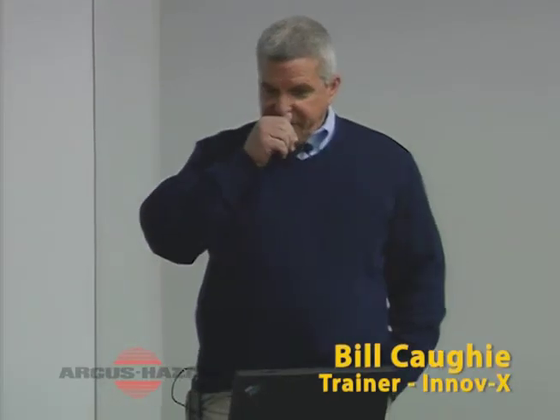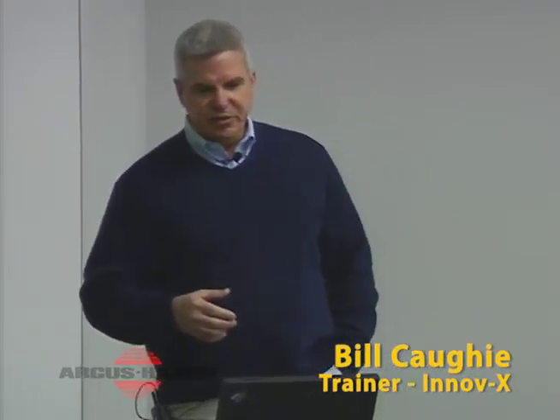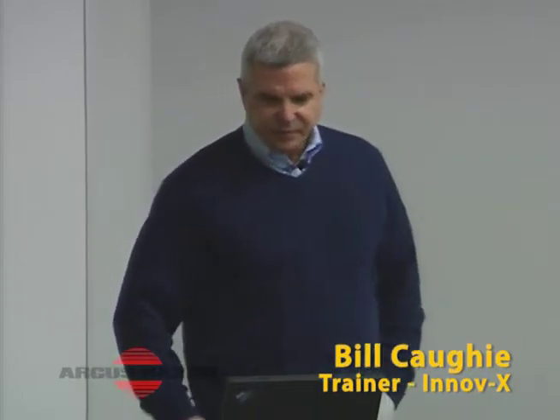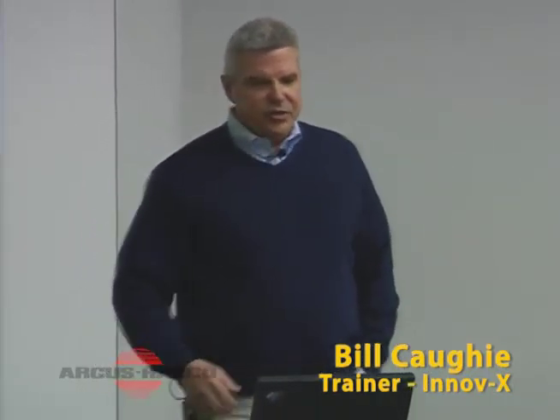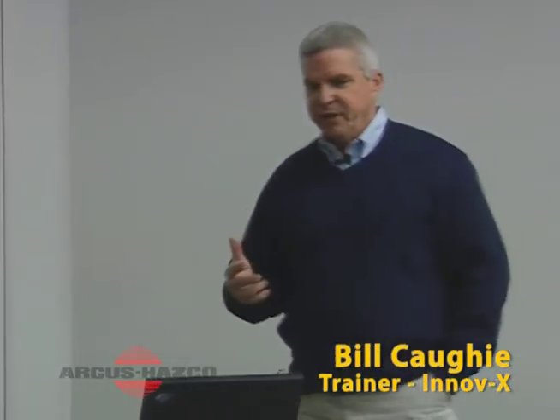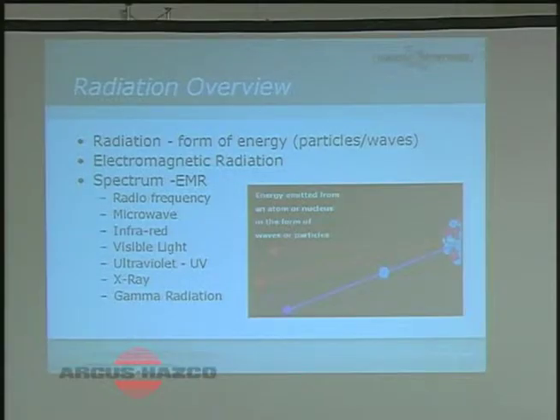But again, we're here to understand radiation, the regulations as it pertains to this instrument, and then the instrument itself. So anyway, radiation is just a form of energy in either particles or waves that are produced from atoms, whether it be from the nucleus in some cases, or from the electron shells in other cases, but it's just energy. And you'll see that here is the electromagnetic radiation spectrum.